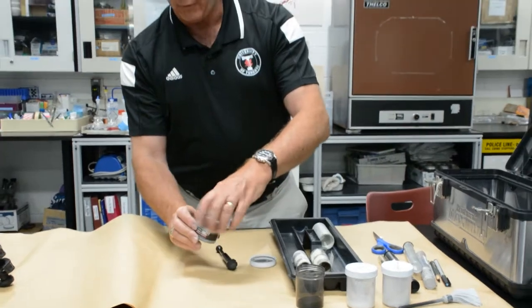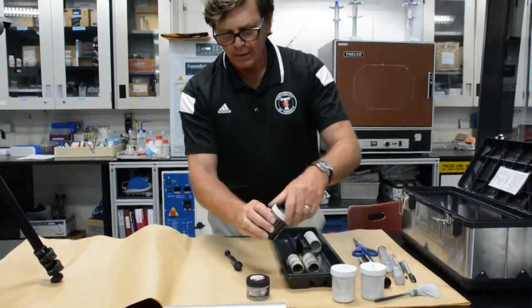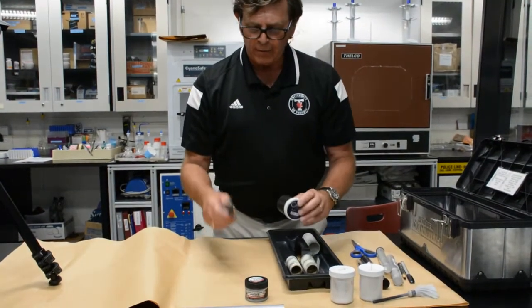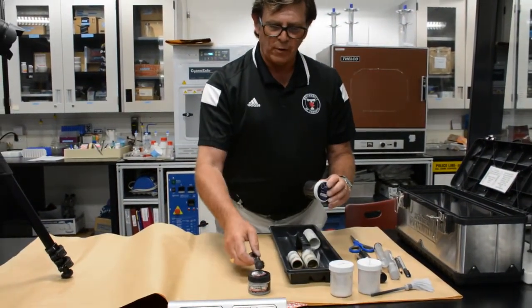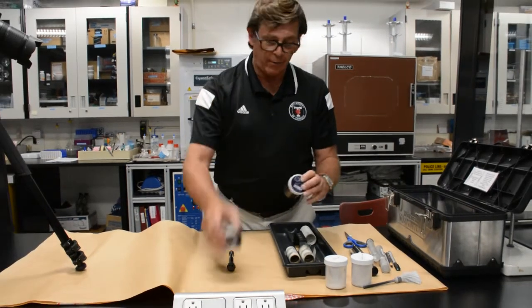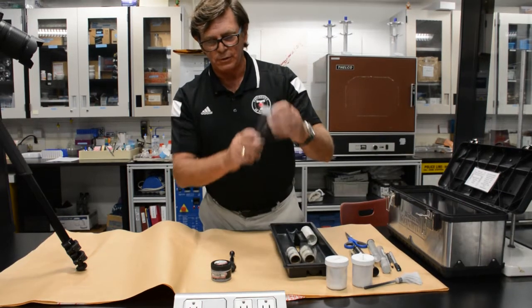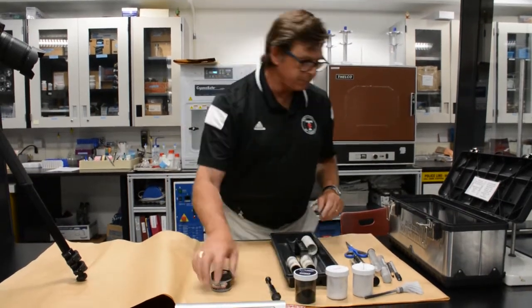So again, we'll do a further demonstration with that as we go through, but just to reiterate, the magnetic applicator is only used with the metallic powder, or magnetic powder, and the fiberglass brush is used exclusively with the granular powder.